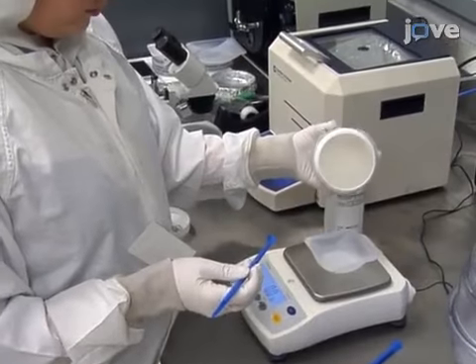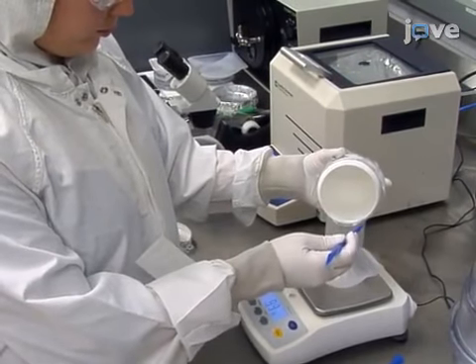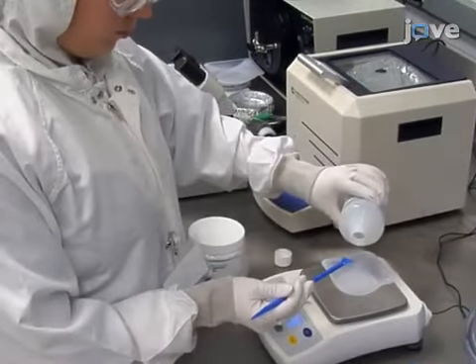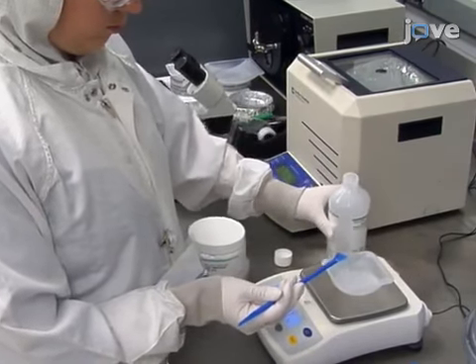To begin the microfabrication process, first make a 20:1 weight ratio of PDMS mixture by measuring 10 grams of PDMS base and 0.5 grams of curing agent in a small plastic dish.